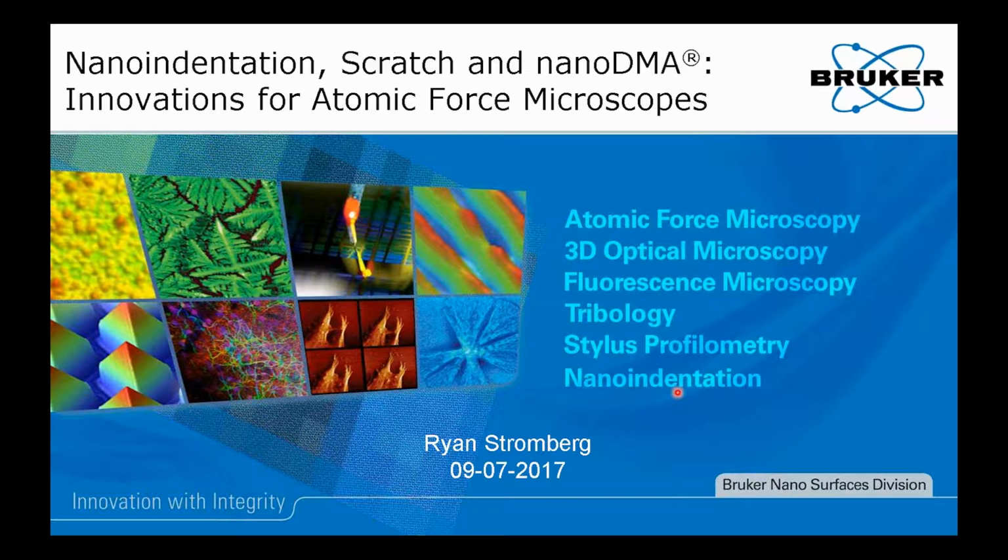In today's webinar, Ryan will present topics that cover nanomechanical properties obtained via AFM-based indentation, the benefits of rigid probe indentation compared to cantilever-based measurements, as well as optional techniques such as Nanoscratch, nanoDMA, and their applications. Our hope is that in this short 30 to 40 minute webinar, we will provide answers to your questions about nanomechanical testing using the Hysitron TriboScope and your existing or future Bruker AFM.